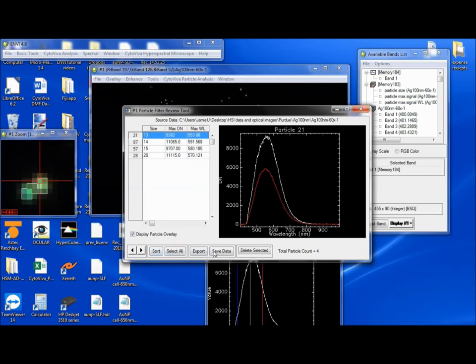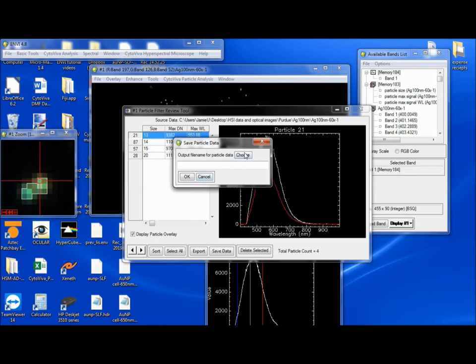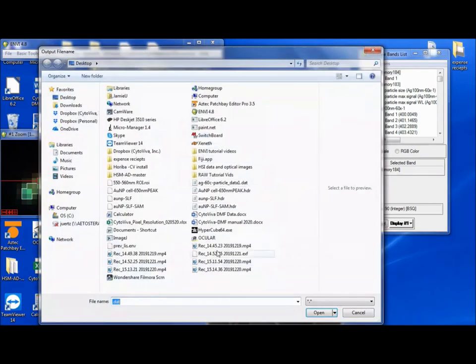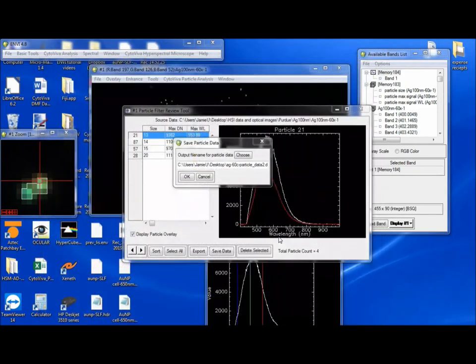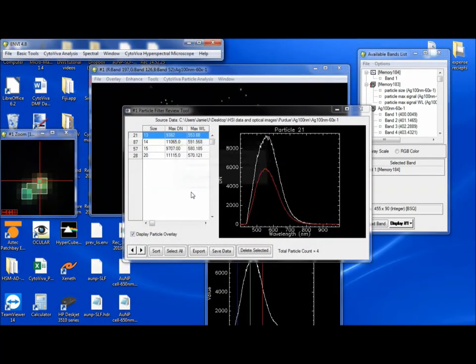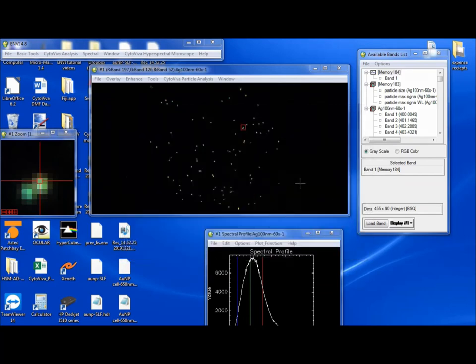And now you can save this data again. And it's a .dat file, that's what it is. Let's say this is data 2. And even if you save it when you close it, it's going to ask you if you want to save it. If you've already saved it, don't worry about it. Just hit no.